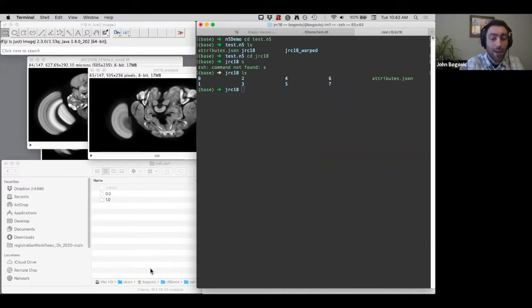Yeah, I also can't wait until OME-Zarr is more adopted, because a lot of what makes my life hard is images being opened incorrectly because some piece of metadata is not there. As soon as the standard is more widely adopted, I hope that all of our lives will be easier. And I completely agree that it would be nice. It will be easy to have the OME-Zarr standard just moved into N5, but HDF5 will be harder.